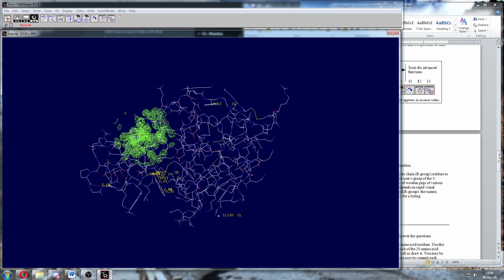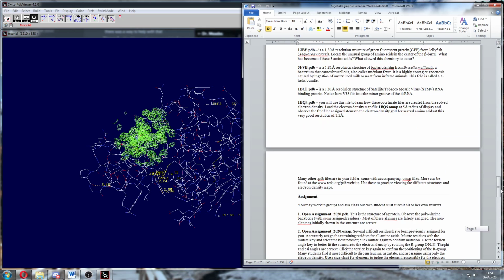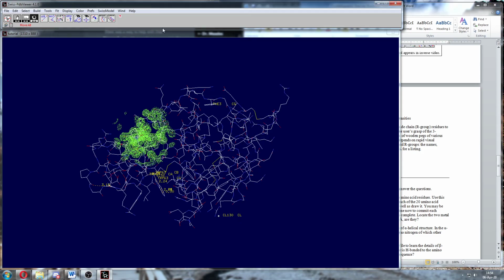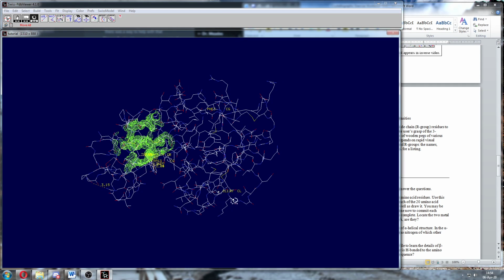And then once you've checked off 10 on your list, right? For the other 10, I want you to do it the other way. Let's say I've checked off 10 of these on the list. I have yet to find a, I don't know, let's pick lysine. Right? So I look here, lysine. Now I have to go find a lysine. Instead of looking at the structure and naming it, I want you to pick a name, lysine. Let's go find a lysine. So we start scanning through the structure until I find a lysine.